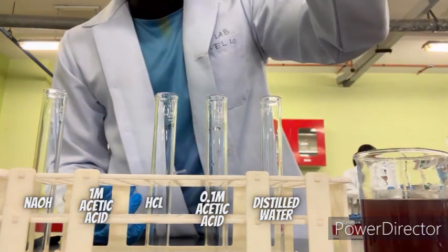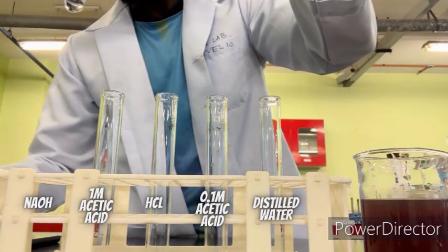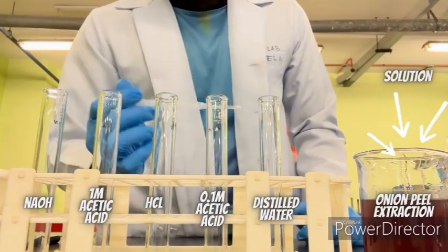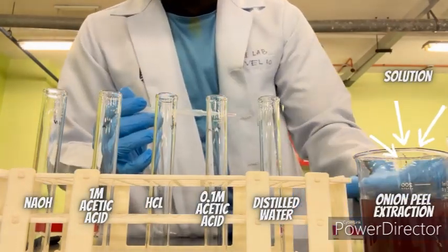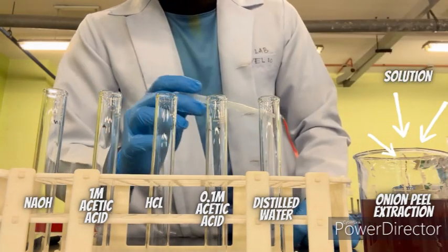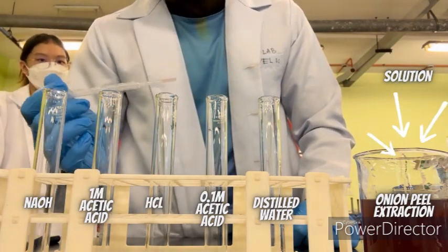This one 1 acetic acid, and this one is NaOH. So we're going to add a few drops of our solution, which is this one, our onion peel extraction, to this chemical here. So we're going to see what the reaction is going to be.